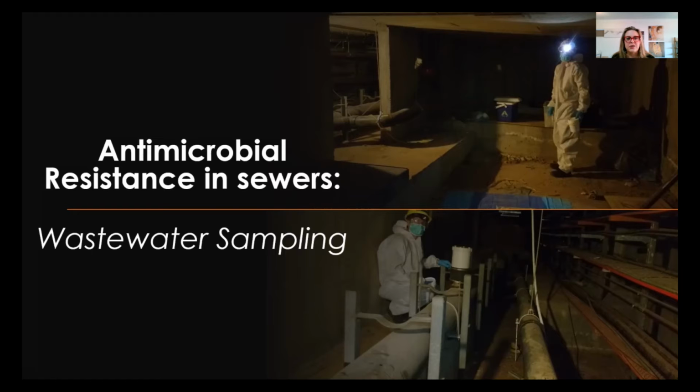So how do we sample the wastewater treatment plants? Here is us in action, doing the dirty job. We literally go into the sewer and, of course, we are fully vaccinated for this. We have the plumber vaccination, and we go in there and sample either daily or hourly. Sometimes we collect samples from early in the morning to late at night to monitor the population, or we collect a daily composite sample to monitor other characteristics of the water and the wastewater treatment plants.